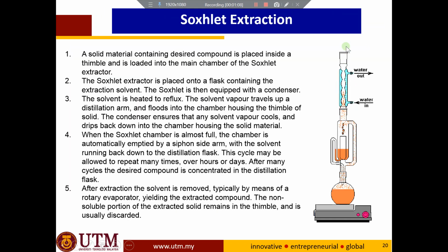So you may ask, why can't we just close the top? Kenapa kita tak tutup je atas ni? Why? Because if we close the top over here, we will create pressure. You know what happens if we create a great pressure, right? We can somehow produce an explosion.